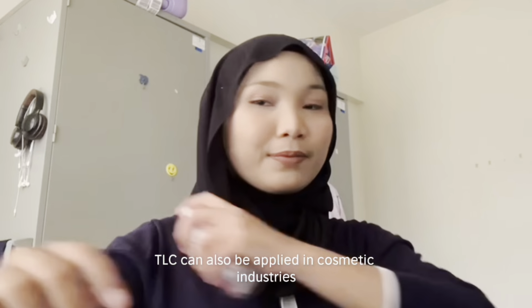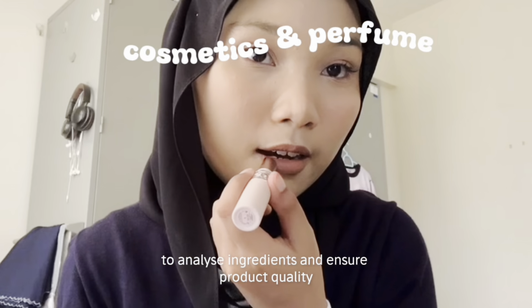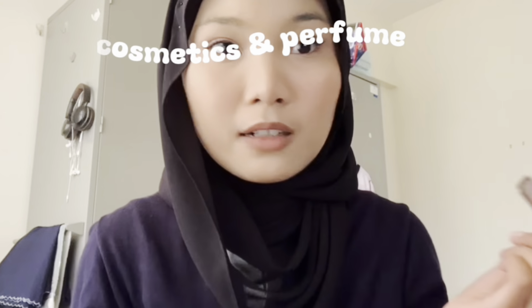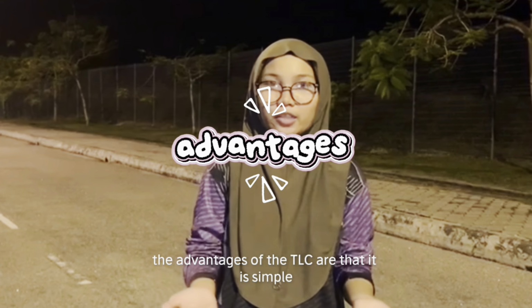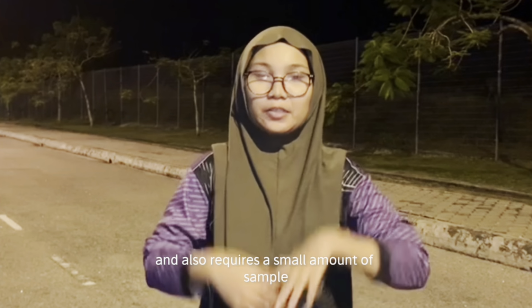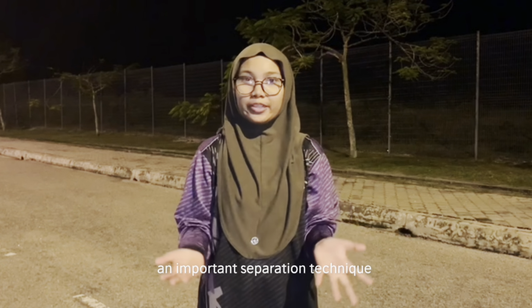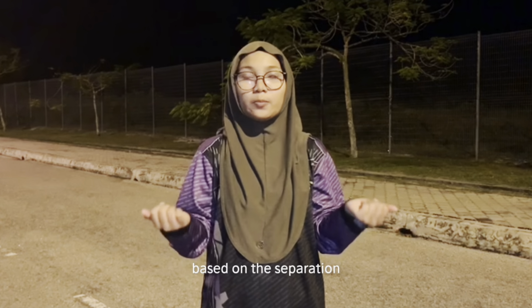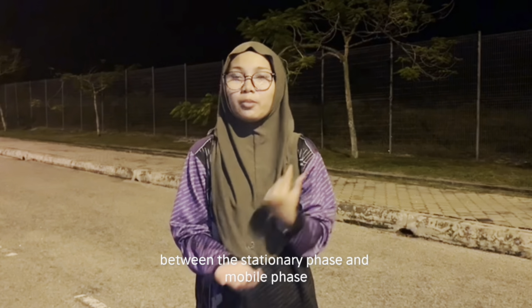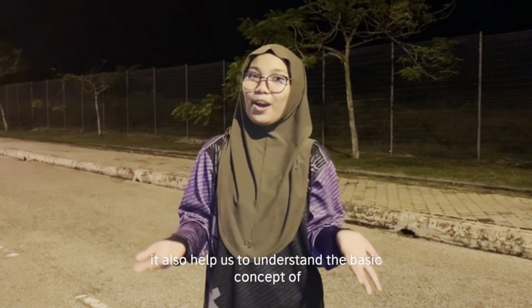TLC can also be applied in cosmetic industries to analyze ingredients and ensure product quality. The advantages of TLC are that it is simple, fast, inexpensive, and also requires a small amount of sample. In conclusion, thin layer chromatography is an important separation technique based on the separation between the stationary phase and mobile phase. Although we use just simple materials in this video, it also helps us to understand the basic concept of separation.